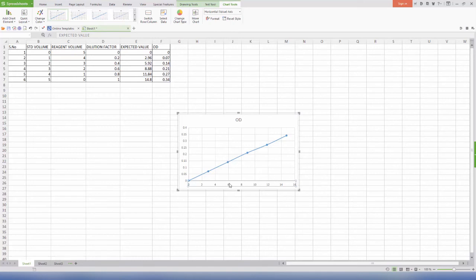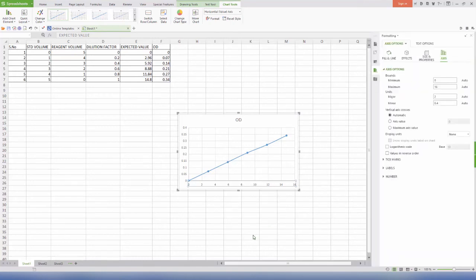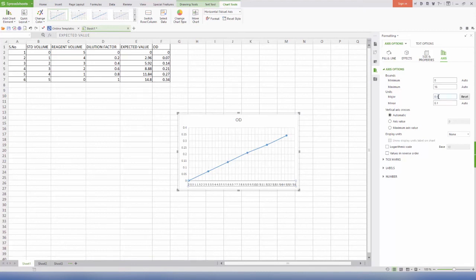Select the x-axis and right-click. Come to the bottom-most option, format axis. Change the major unit to 0.5 and enter.